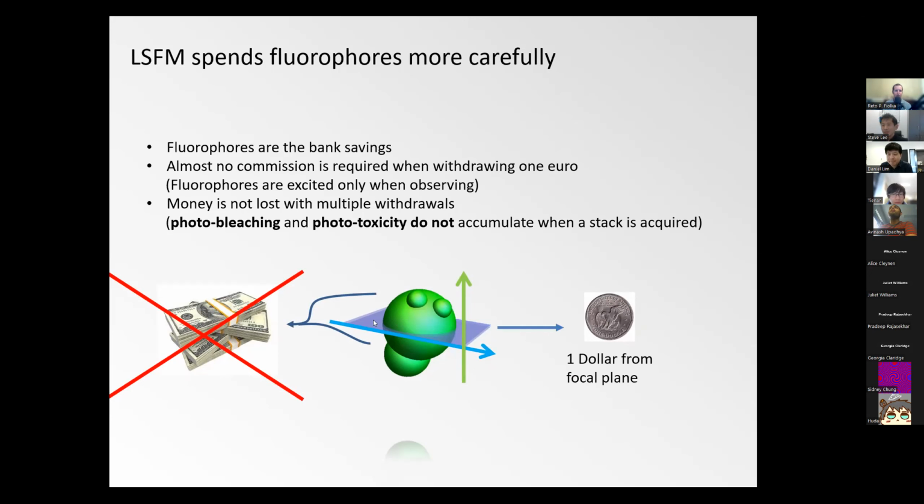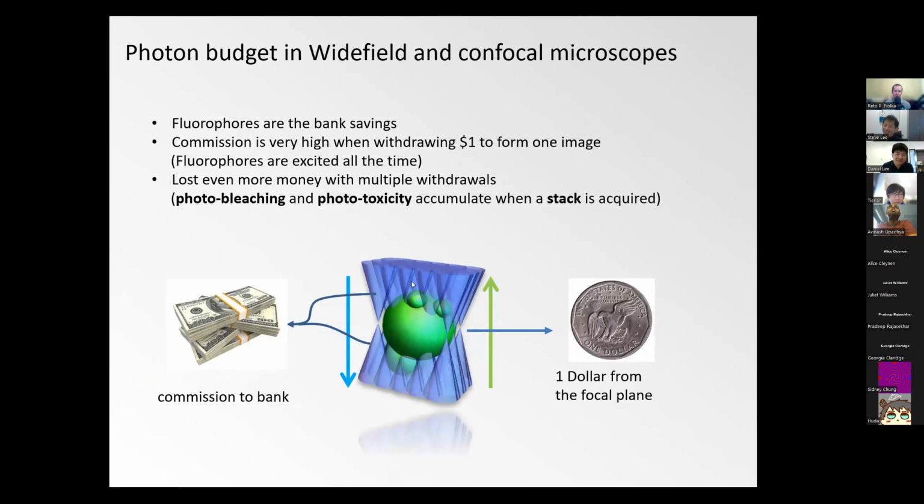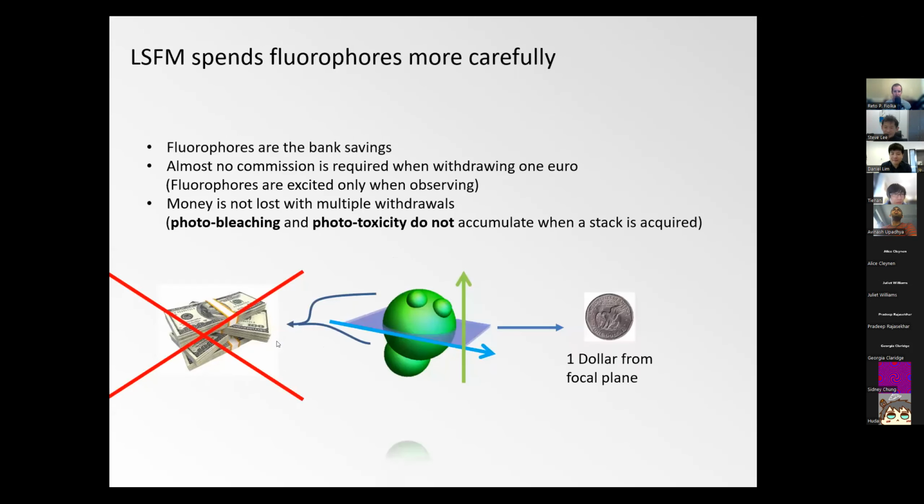All right. So sorry for the very basic, but for most people, it becomes much more clear when we talk about money. So sorry if I assume that. Maybe that's just the thing in the US, but nevertheless, when you say 90% of the fluorescence you excite in a sample in a confocal is not used, sometimes it doesn't drive home the point as much as if it's the money in your bank account that just goes away. Well, all right, enough of that.